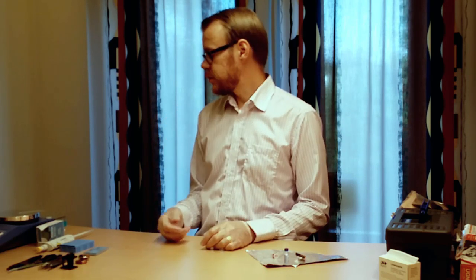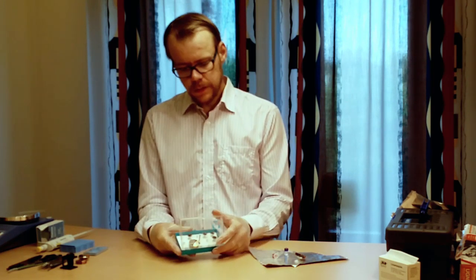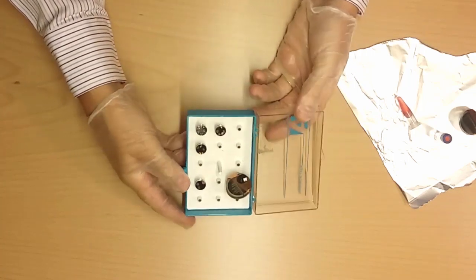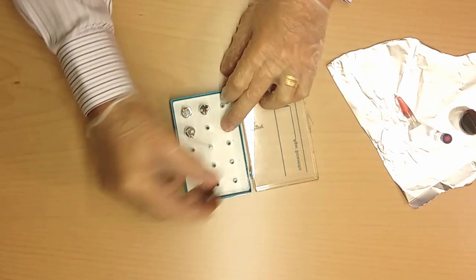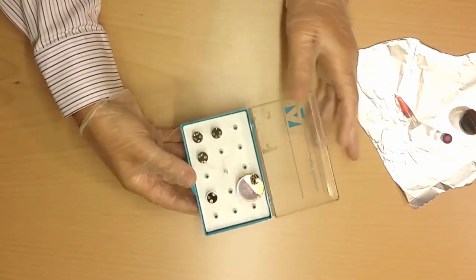When you sort of finish with your samples you usually keep them in store in some boxes or something. And there are some dedicated boxes for that. This is a typical box when you do scanning electron microscopy. Here you can put your ready pieces like so. And you can keep them safe. And carry them around with you when you go back and forth to the lab.